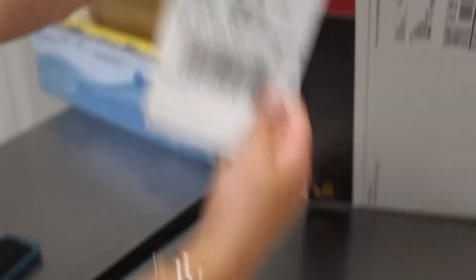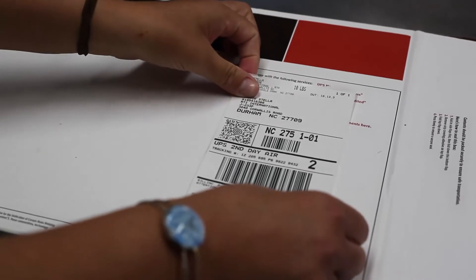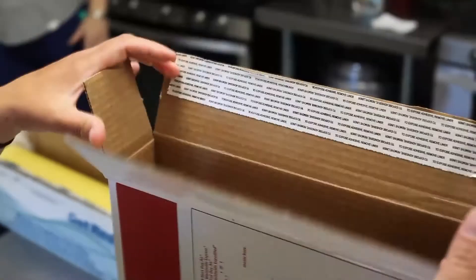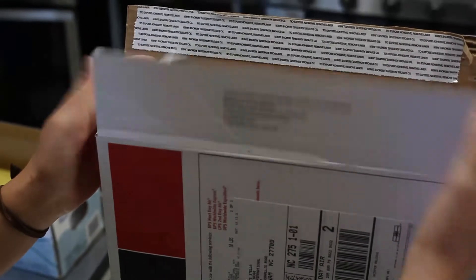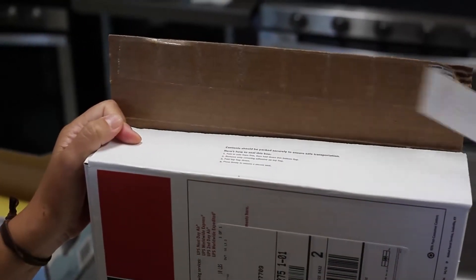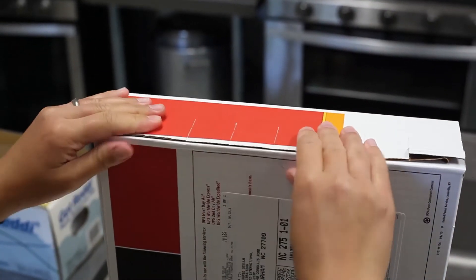Now you will take your return UPS mailing label and place it over the label that the box came in. Now you will close up your box — flaps first. Remove the liner and push down on the adhesive so it is very tight.